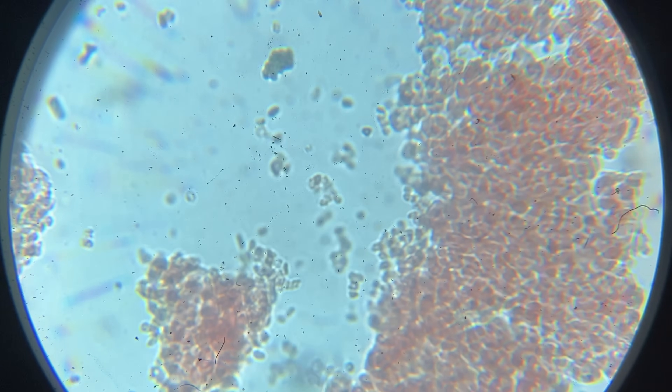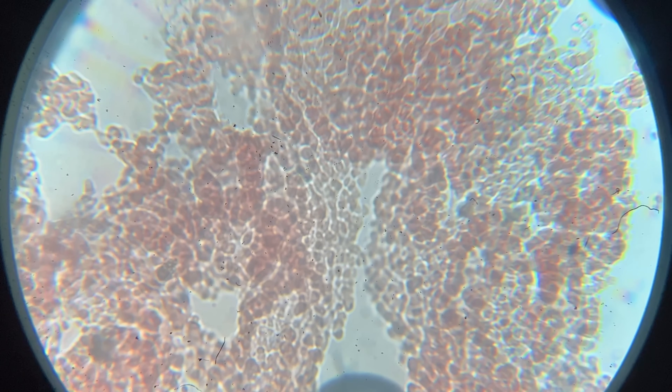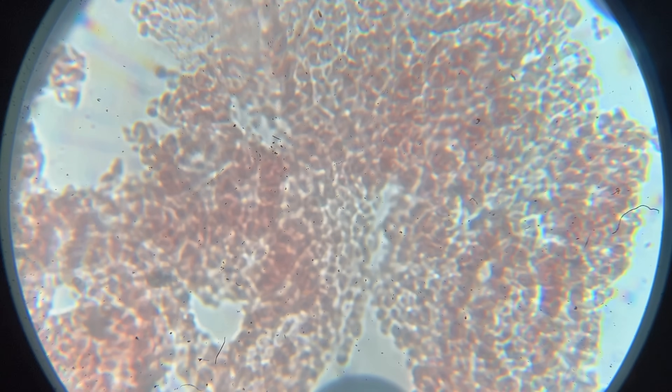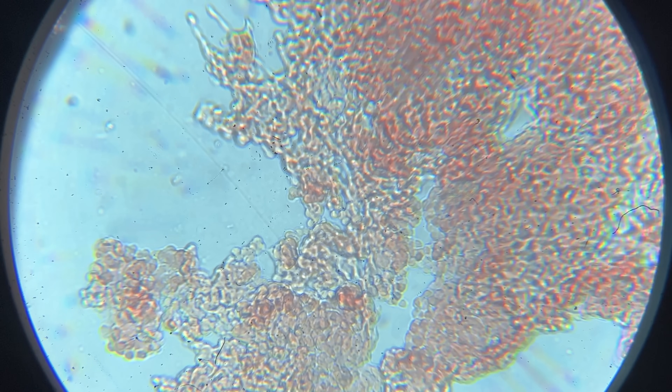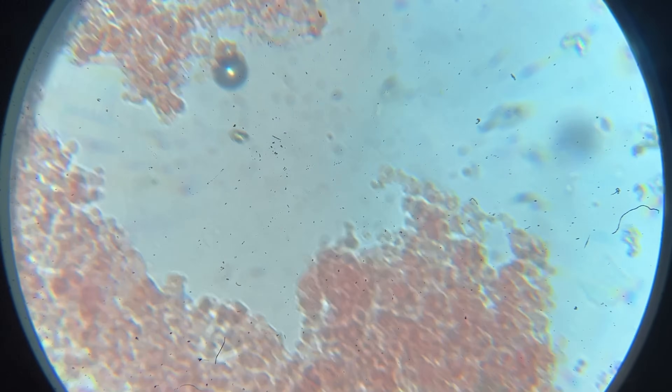Now have a look at the rattlesnake venom slide — can you see the difference? It is frightening to see with my own eyes what these snakes can do to you. The distribution of the cells has changed: we see patches where they are thicker and more clumped together, and areas where they're thinner, almost like they've formed a clumpy matrix — like a gel. You can see spots with a lot of pink in the slide. That's hemoglobin — the contents of the blood cells spilled out by the venom popping the actual cells. And you can see fragmented, shredded bits of cells everywhere.